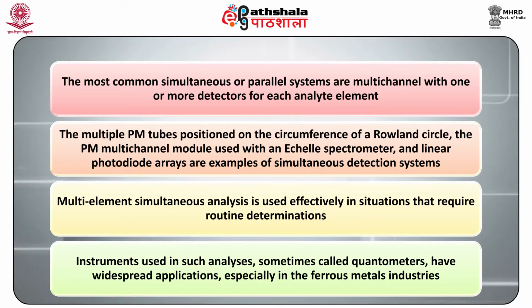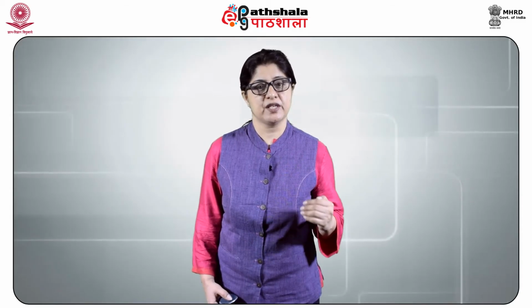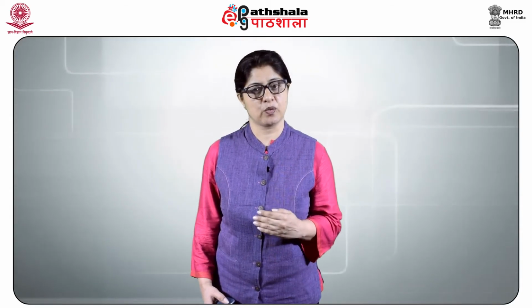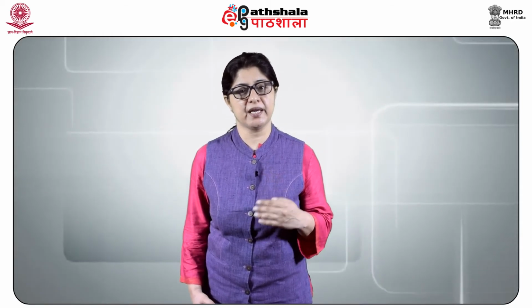Multi-element simultaneous analysis is used effectively in situations that require routine determinations. Instruments used in such analysis, sometimes called quantometers, have widespread applications, especially in the ferrous metal industry. For less routine analysis involving greater control of optical parameters, instruments with greater flexibility are required. If sample sizes are adequate, sequential multi-element instruments provide the flexibility needed.